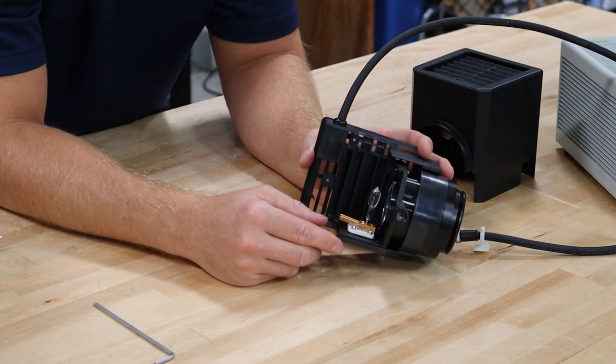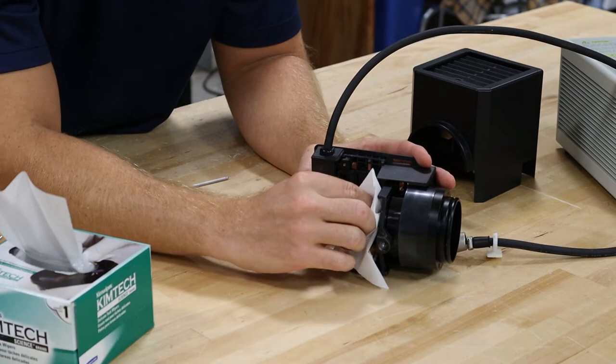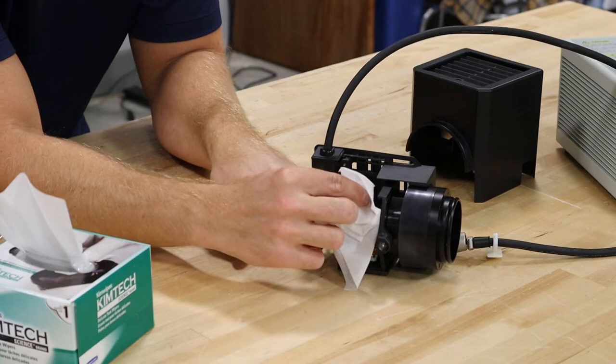There we go — like magic. Go ahead and grab a Kimwipe. You never want to touch the glass on the bulbs with a bare hand. Then you're going to mash this down to release the bulb — this bronze connector.